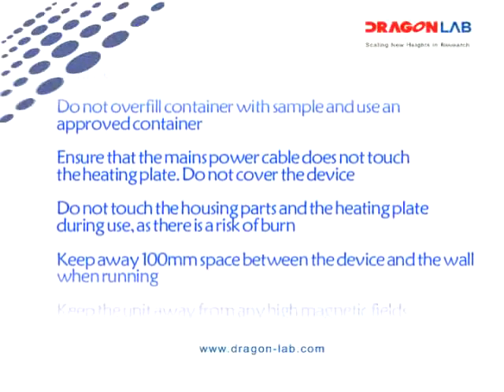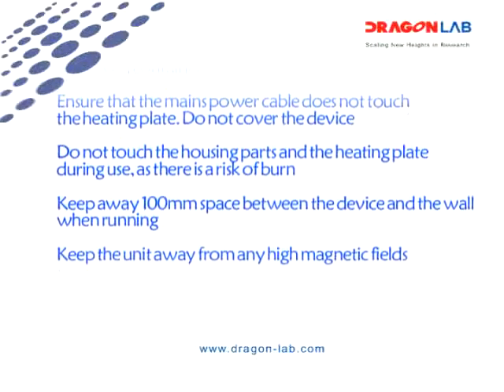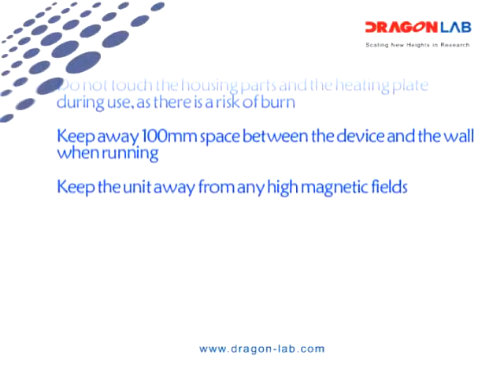Do not cover the device. Do not touch the housing parts or the heating plate during use, as there is a risk of burns. Keep at least 100 mm of space between the device and the wall while running.